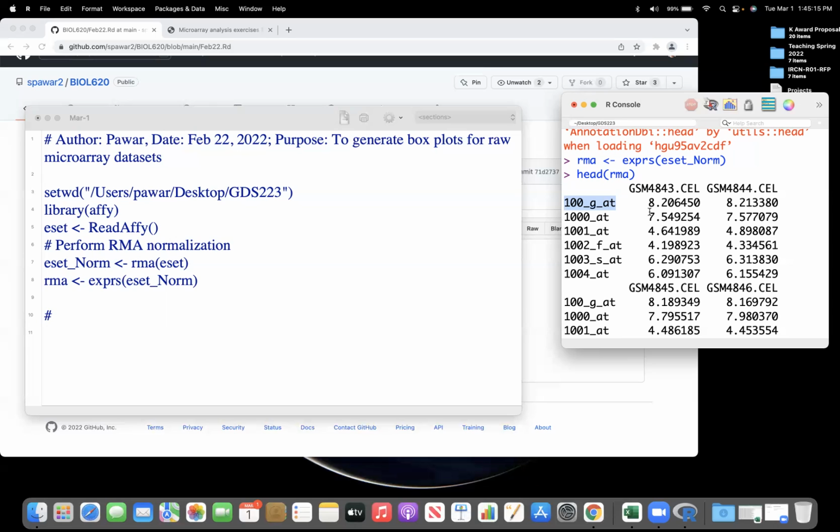So what I will do is I will have two samples. Sample 1 would be the treatment, the cell line treated with that drug, and then I will have a control, the same cell line, no treatment, right? So treatment is the cell line with the drug, and control is the cell line without the drug. Then I will do a microarray, and I will get the table. I will have intensity values, as we have now, for treatment and for control.